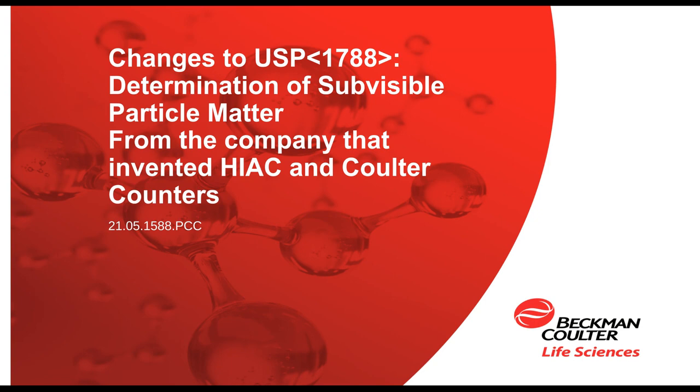The HIAC light obscuration test remains the preferred compendial pass-fail test method and backed up by the microscopic membrane method where required. This revised chapter introduces for the first time the orthogonal or complementary flow imaging test method as a useful complementary tool to these methods, and it emphasizes its use for characterizing the particle load in products and how it can help with forensic examinations to identify the contaminating particles to support product improvement, of course, as well as root cause investigations.